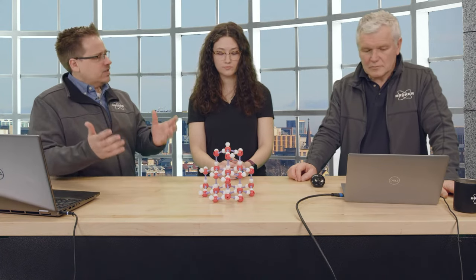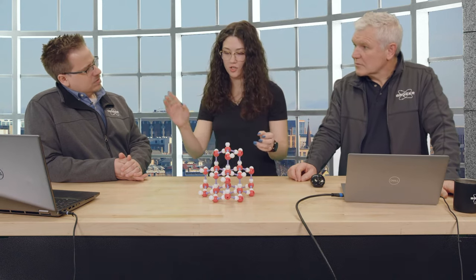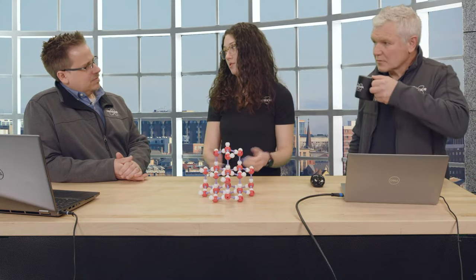Now, what about lattice vibrations? Would that also be an example? That would be smaller and separate from this modulation. And you can also decrease those, the thermal movement at least, by measuring at lower temperature as well.